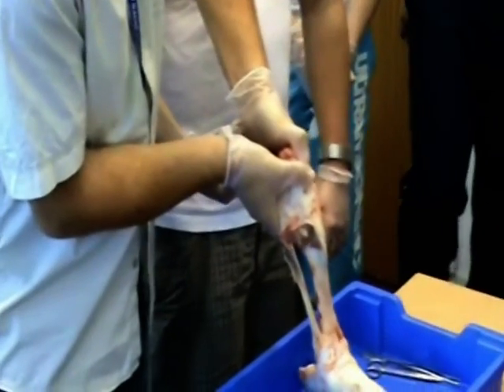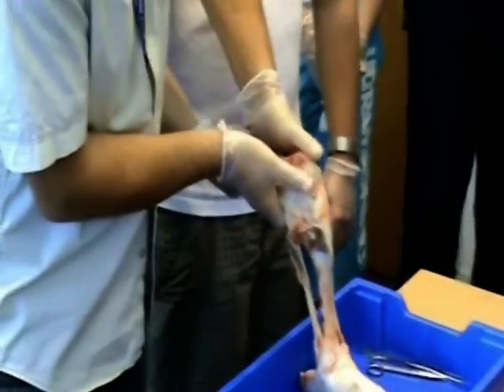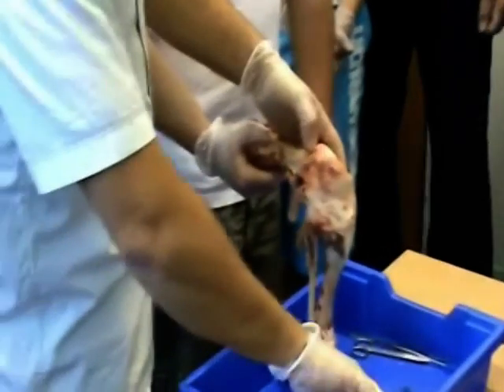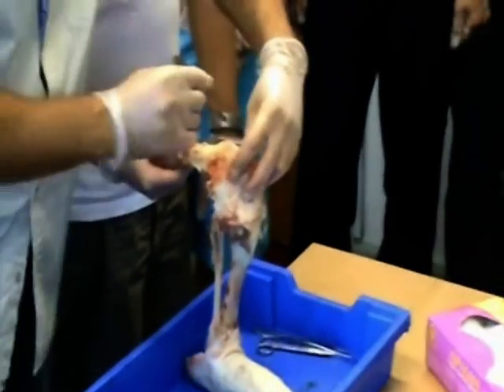Okay, it's a bit slippery. So squeeze. There we go. So the kneecap assists in the mechanical movement of the knee. It's not just there for pretty. It's not just there to look nice.